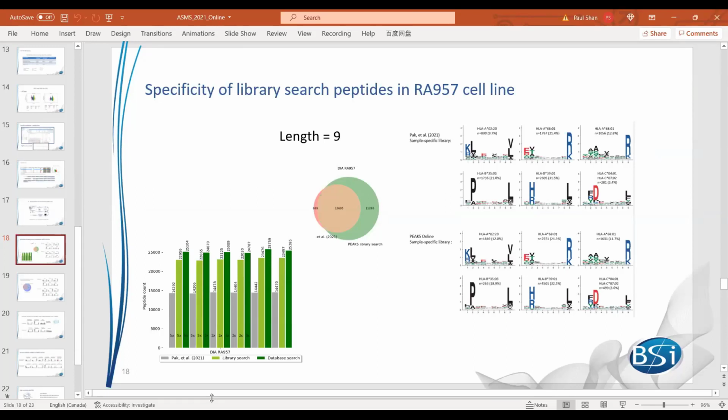Theoretically, with enough data sets, we can do whatever modification you want, but in reality you need data sets for the training. The good news is that for common PTMs, including phosphorylation, our current model can handle them. But the challenge is that DIA is not as versatile as DDA data, where you can do open PTM search. For DIA data, there are still some challenges there. We are working on those.